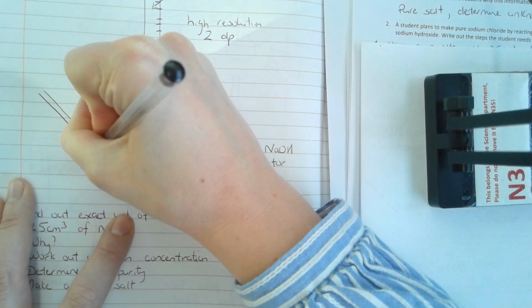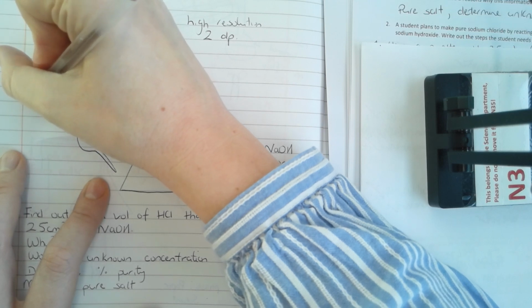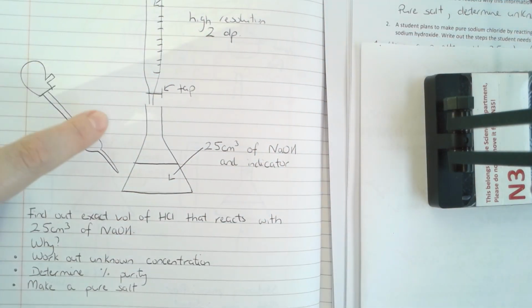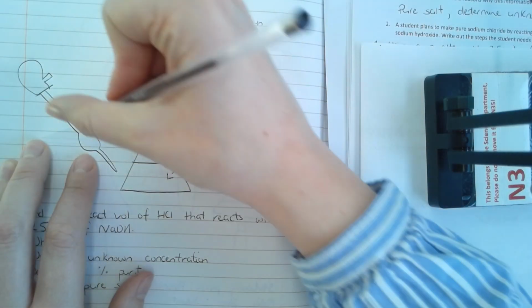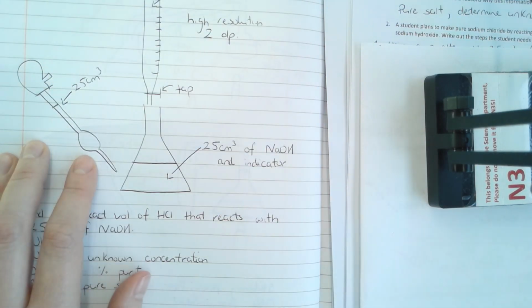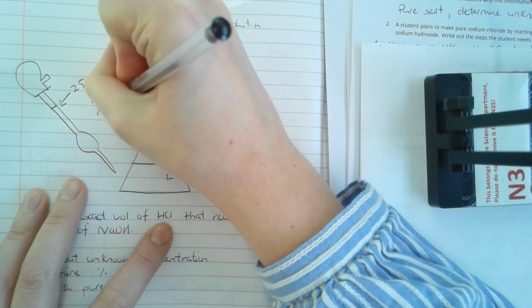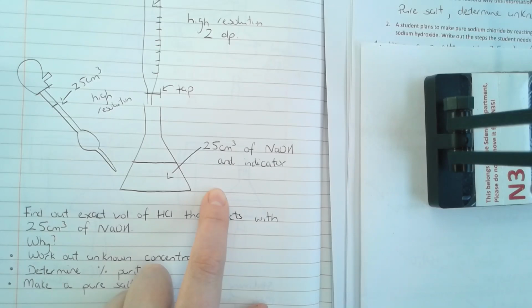Not one of those little dropping pipettes. It's a pipette that looks something like this, and you use what's called a pipette filler, which sometimes looks a bit like this. You use this kind of pipette filler, a suction device, and pipettes measure one volume and one volume only, and the volume they measure is typically 25 centimeters cubed. So again, it's got a high resolution. It will allow you to very accurately measure the volume of the solution that's going into the conical flask.